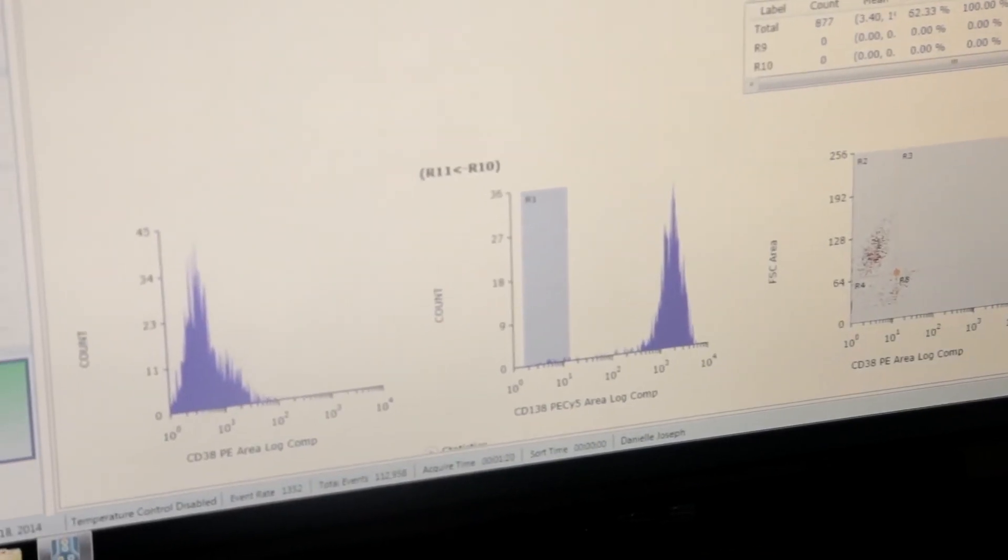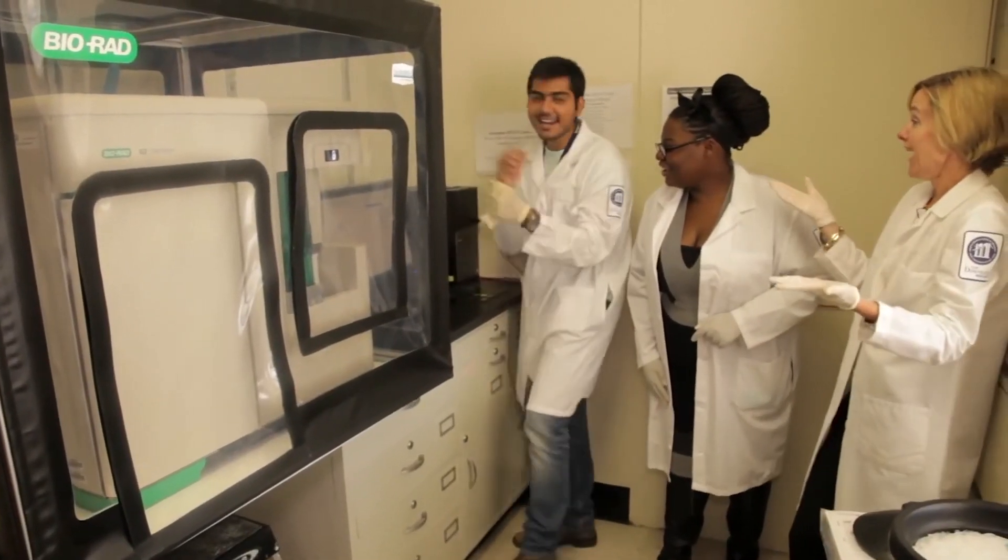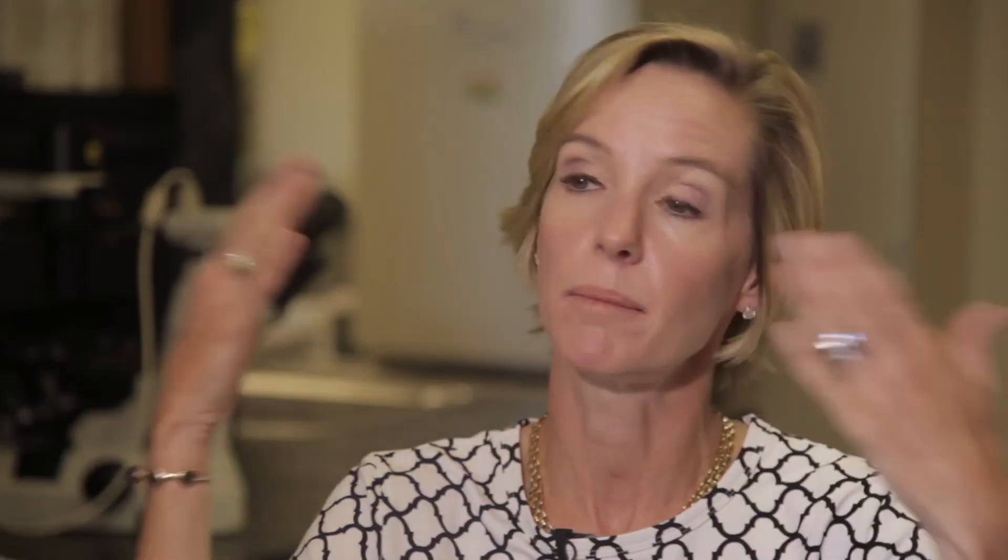I think this is, for me, has been one way that I can be bigger, I can be broader, I can do science the way that it should be, I can do science the way that I want to do science.